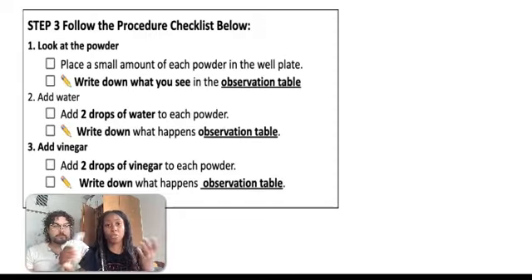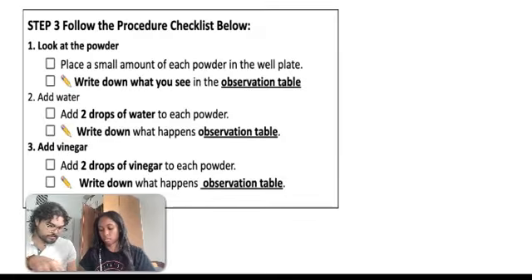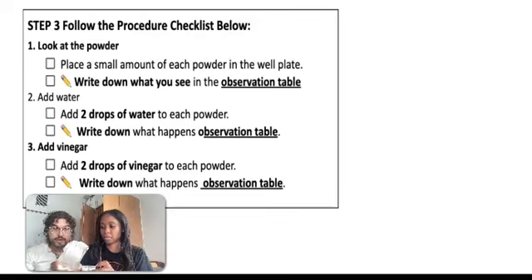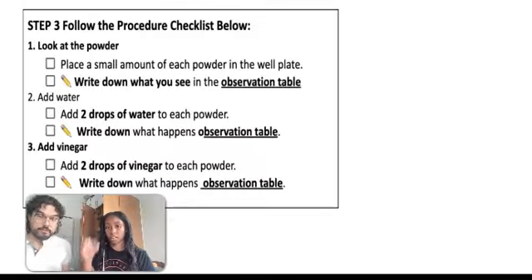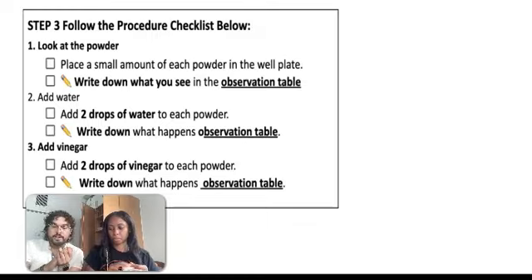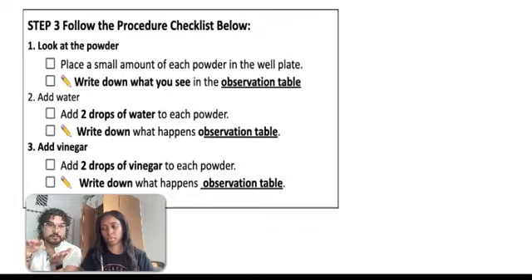Okay, then you're going to do that for the remaining amount of your powders. I'm going to put a little bit of, oh, I just did C. I already did C. Let's do A. We're using the spoon labeled A for powder A. Great. Then we would do covering back. Nice. Always putting the cap back on so we don't make a mess. And we're going to do that. We would repeat that for B, C, and D. We already did C, but you see what I mean.